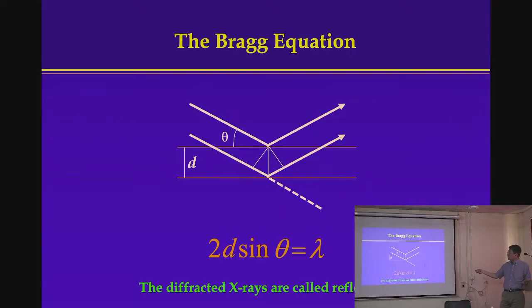This angle is theta by trigonometry. This angle is also theta. So that means the angle between the beam that goes through the crystal and the diffracted beam is 2 theta. Right? And that you know very easily, because you know where the direct beam hit your detector and where the diffracted beam hit your detector, and then the rest is trigonometry. I'll show you that in the next slide or in a couple of slides. That's actually an important concept we'll talk about as well.